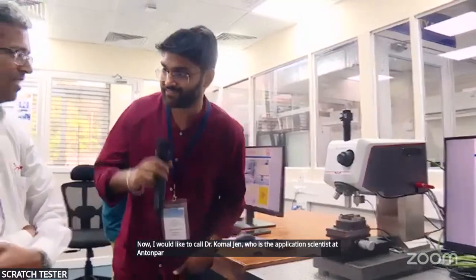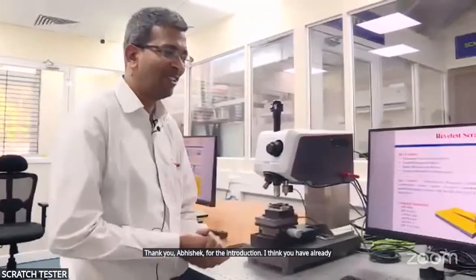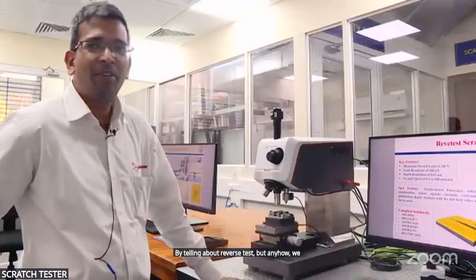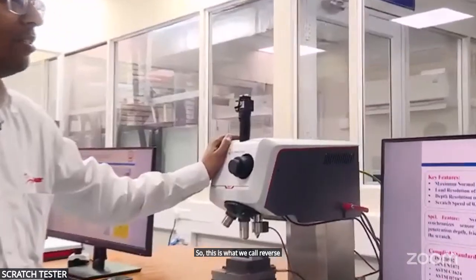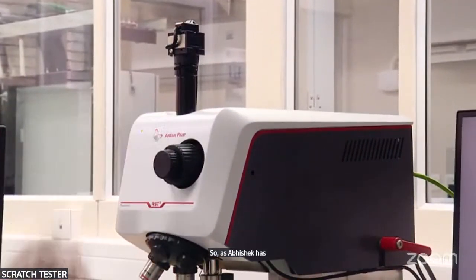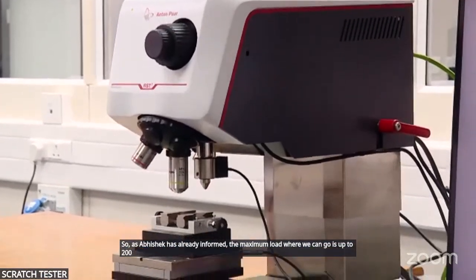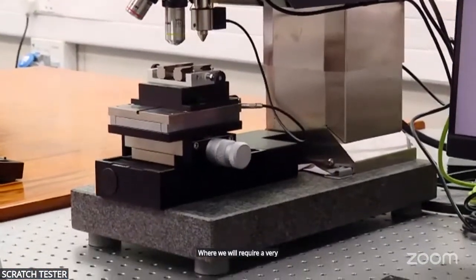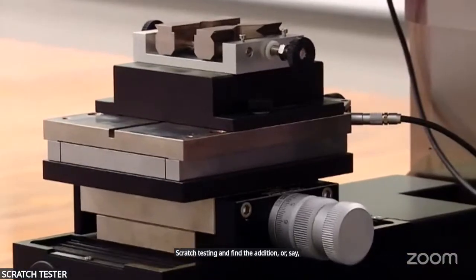Thank you, Abhishek, for the introduction. I think you have already done part of my job by telling about the Revetest, but anyhow, we will go into full detail now. This is what we call the Revetest Scratch Tester, RST3 in short form. As Abhishek has already informed, the maximum load we can go up to is 200 newtons. So it's very good for our hard coatings, where we require a very high load to do the scratch testing and find the adhesion or lifetime of the coatings.